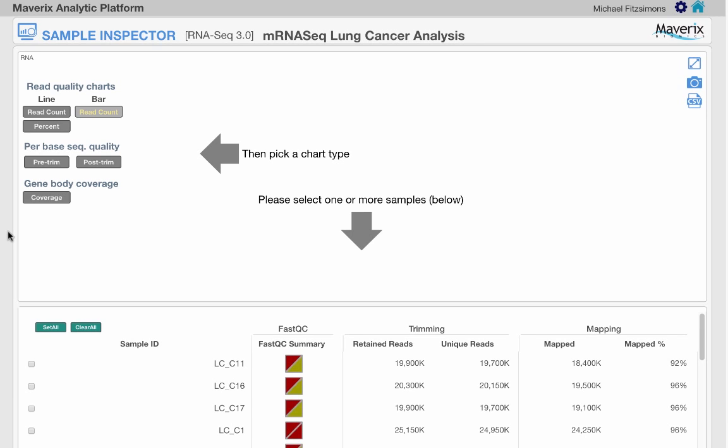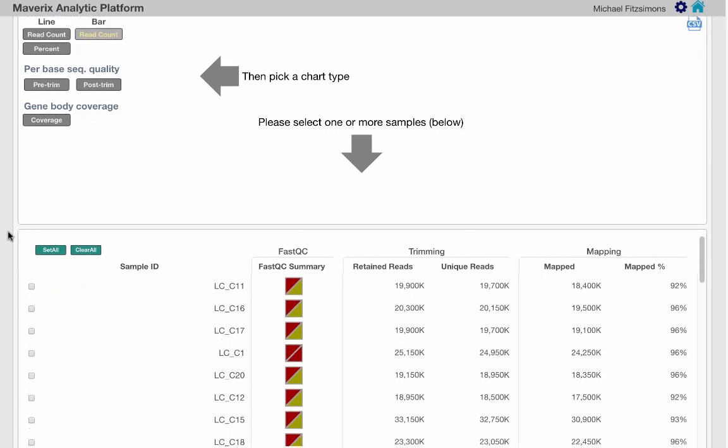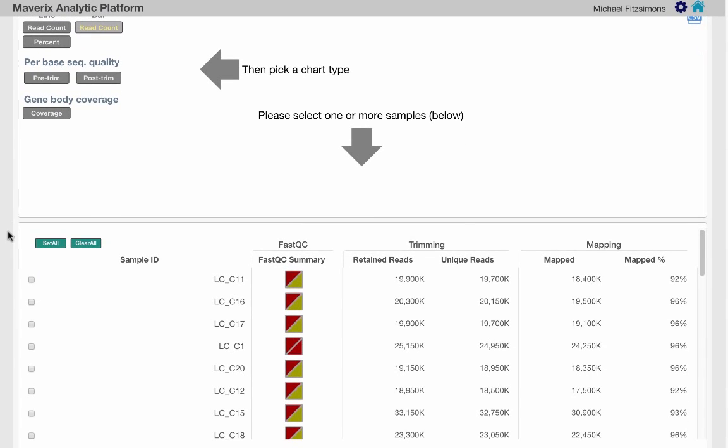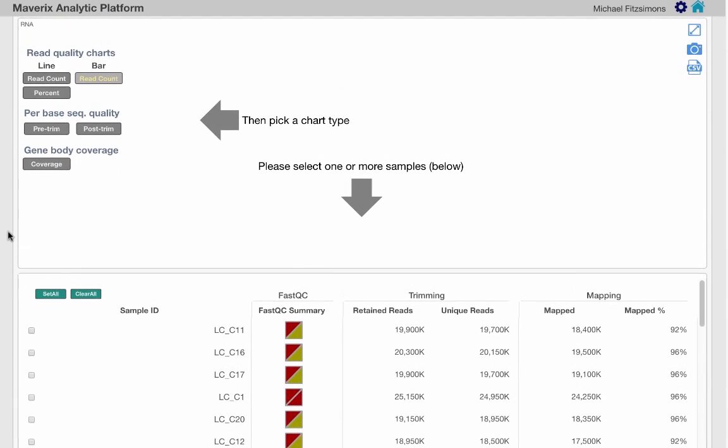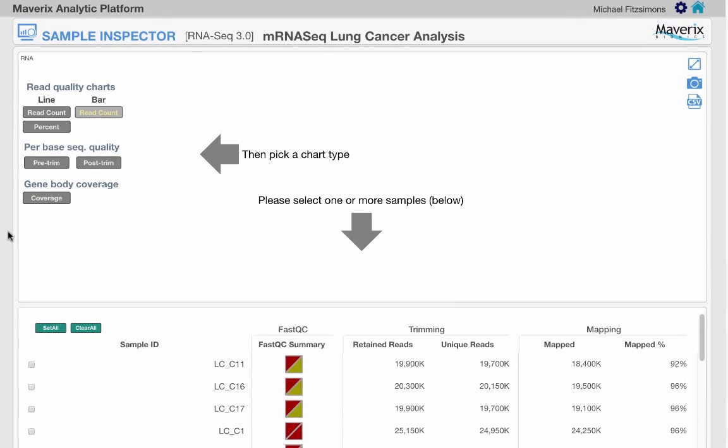The sample inspector consists of an expandable table at the bottom and a space for charting various results at the top.